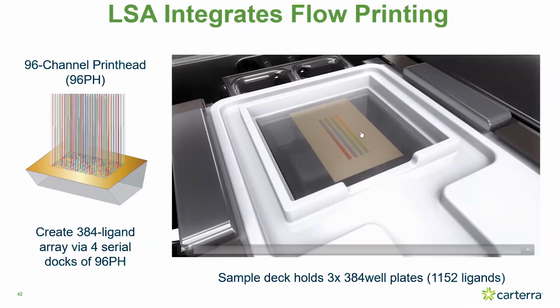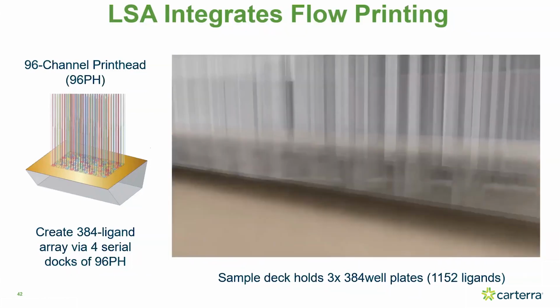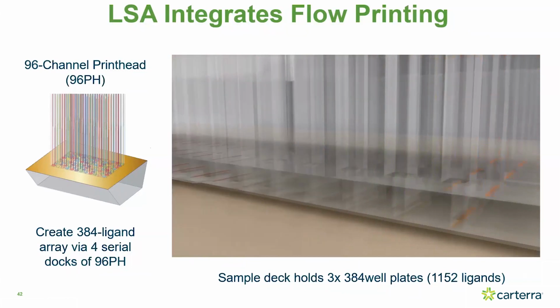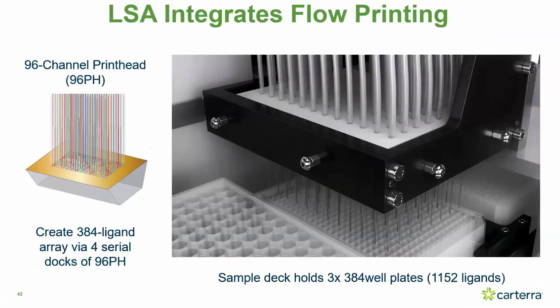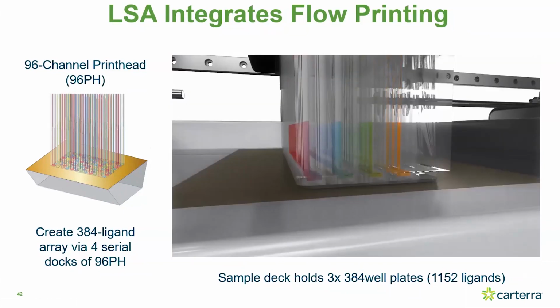So you can do all of the chemistries that you would typically do on an SPR biosensor, and you can do charge-based pre-concentrations to immobilize from low concentration samples. You can make an affinity capture surface and then flow for an extended period of time low concentration crude samples to concentrate your ligands onto the surface. So you're capturing from a supernate or a bacterial extract.